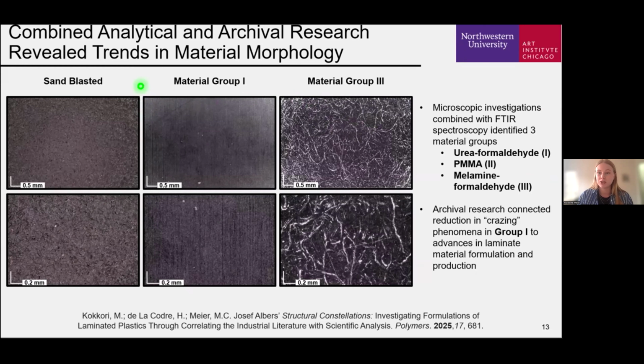Microscopic investigation revealed two distinct types of feature morphologies, and FTIR spectroscopy revealed three distinct material groups across the 50 works. The first type of features observed are deliberate artistic choices, such as the sandblasted regions depicted in the micrographs here, as seen in the observed shading on the Structural Constellations on the previous slide. The second type is related more to the inherent differences in the unaltered laminate surfaces.